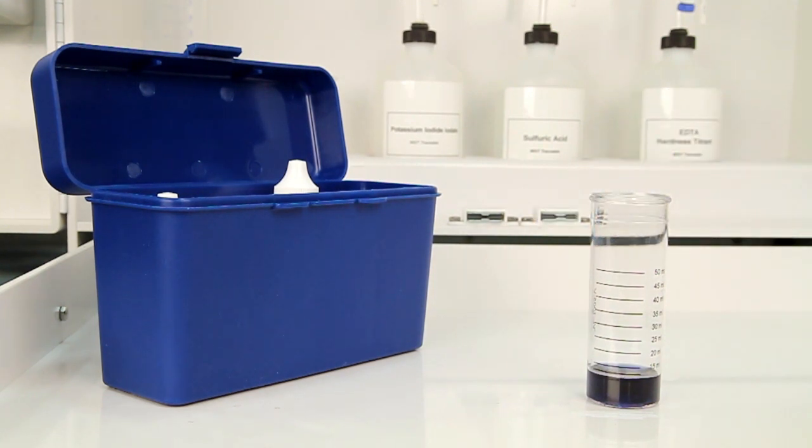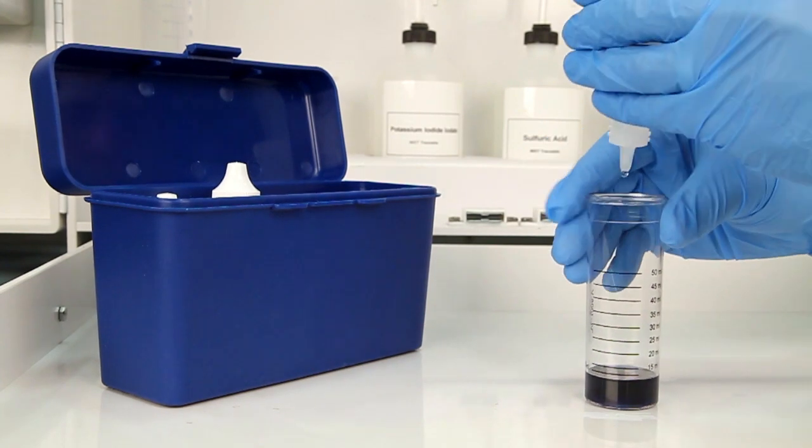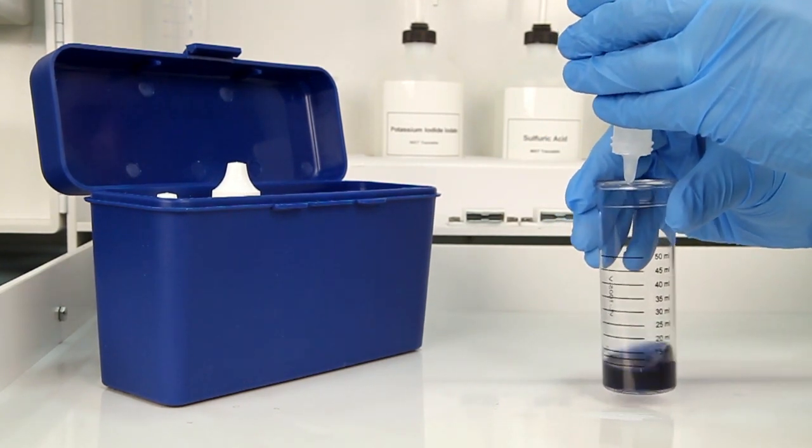The sample should turn dark brown to dark blue if iodine is present. The next step is to perform the titration using sodium thiosulfate titrant. It's important to make sure you have the proper titrant and the proper sample size for this titration.